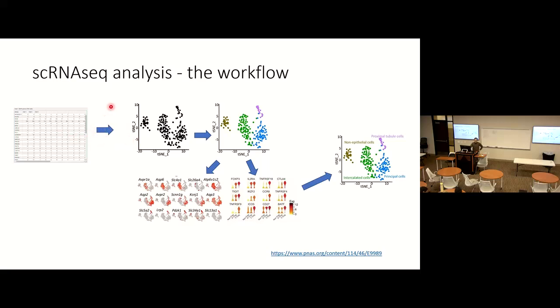So this step is in between. This will facilitate the downstream analysis. For example, after dimensionality reduction, this becomes a table of 50 PCs versus however many cells you have. So this matrix is smaller than before.